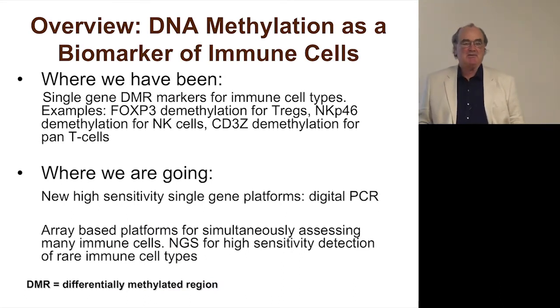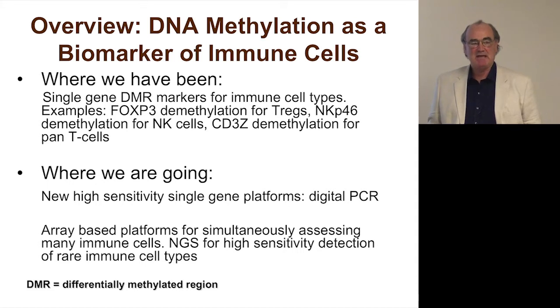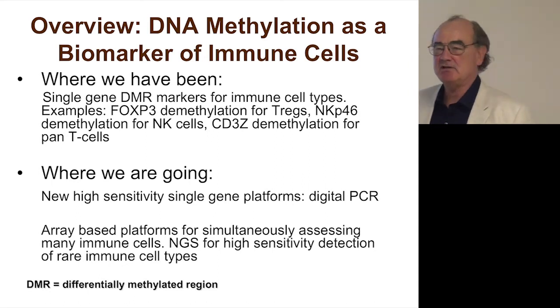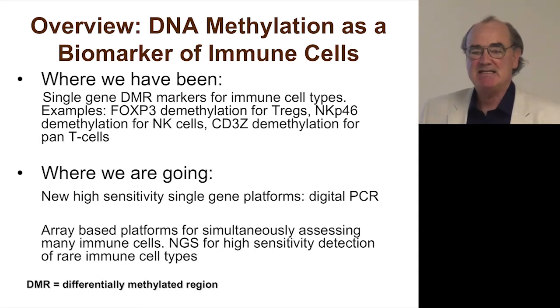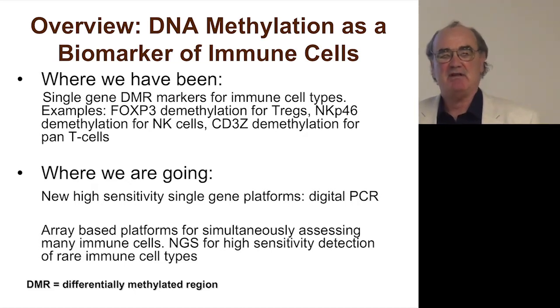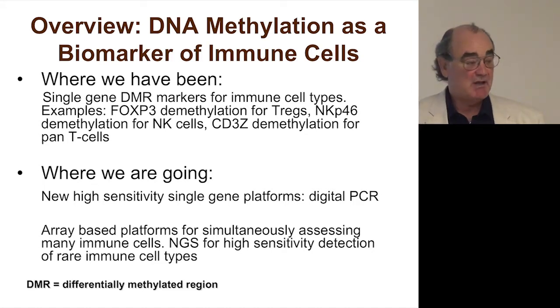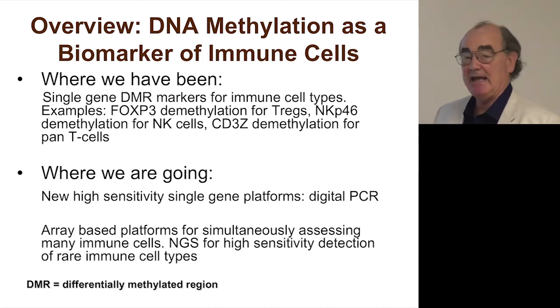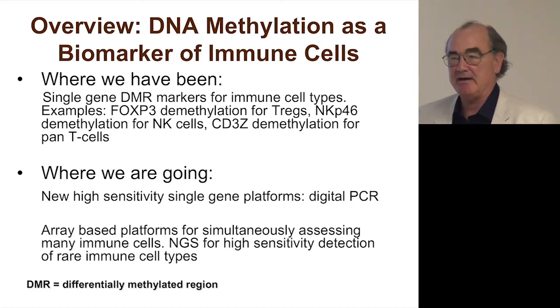Essentially, I'm a molecular epidemiologist and have been working on understanding causes of cancer and why people get cancer and how they respond to therapy for many, many years. And one of the things we've always been interested in, especially in neurological surgery in terms of brain tumors, is the influence of the immune system. But in my lab, we have 12 or so -80 freezers, and over the last 25 years, we've collected thousands and thousands of samples of blood from patients with various cancers, but certainly a lot of brain tumor patients, and also carefully selected controls from around the Bay Area.